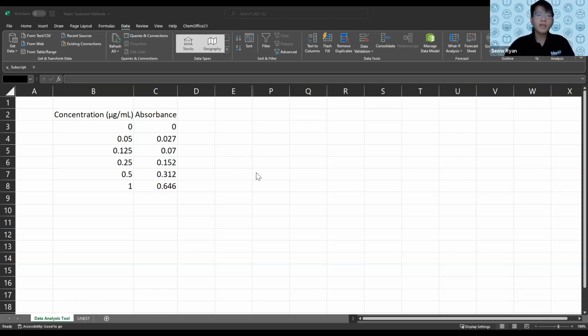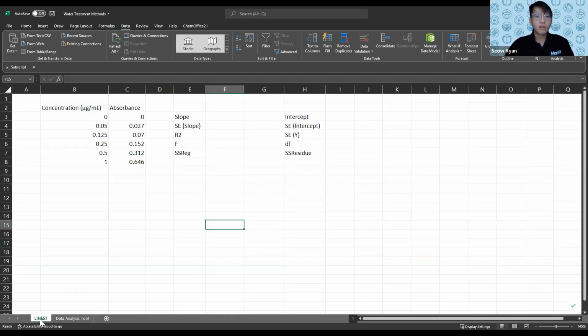Okay, so let's start off with Excel. Where's my Excel? Okay, so in the handout, you are given these values. I mean, you can type it up manually. There are not a lot of values, so please go ahead and type it up manually. Okay, so the first method I want to teach, based on the order in that slide, is LINEST first.